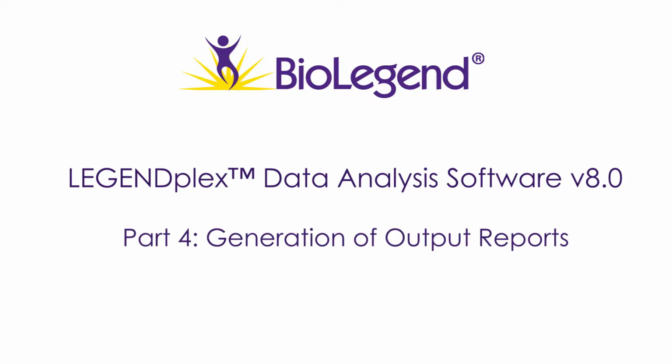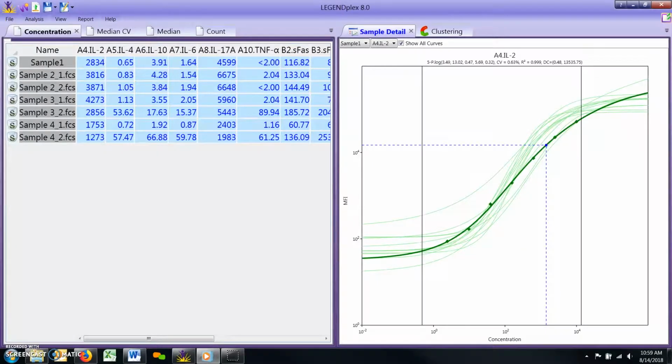Generation of output reports. After you have finished reviewing your analysis results, you will want to export them out of the software platform. Begin by clicking the Report tab at the top of the screen.